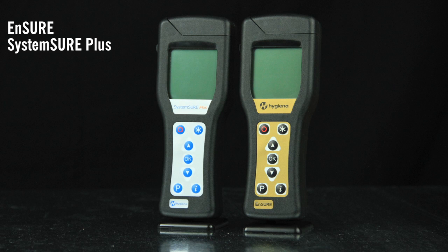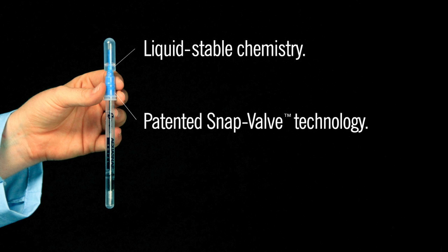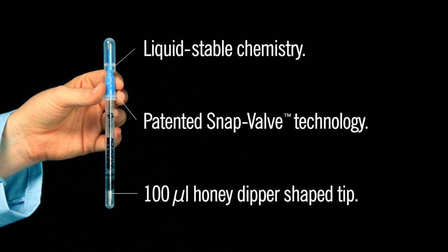Aquasnap devices are compatible with Insure and SystemSure Plus luminometers. Liquid-stable chemistry eliminates the need for lyophilized pellets, enabling consistent and accurate results. Patented snap-valve technology makes activation and mixing effortless. The honey-dipper shaped tip collects 100 microliters of water, ensuring consistent sample collection.